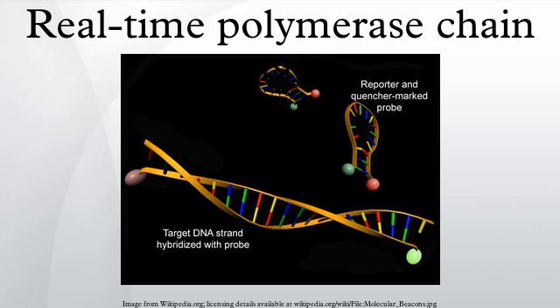For mRNA-based PCR, the RNA sample is first reverse transcribed to cDNA with reverse transcriptase. In order to amplify small amounts of DNA, the same methodology is used as in conventional PCR using a DNA template, at least one pair of specific primers, deoxyribonucleotides, a suitable buffer solution and a thermostable DNA polymerase.